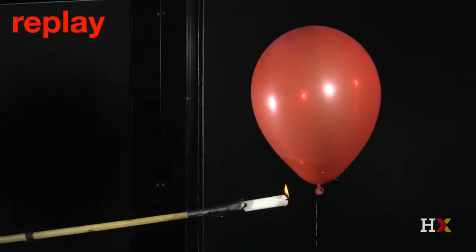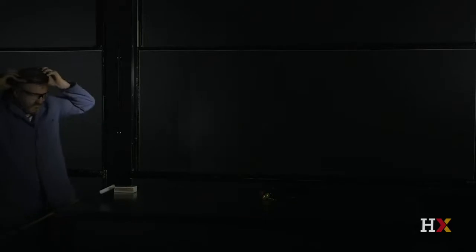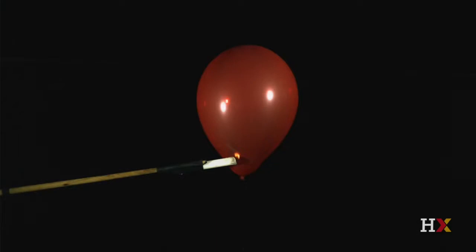This time, when the flame touches the balloon, it pops open with a very loud and explosive sound, and an intense fireball forms immediately. But in this one, the candle is still lit. Let's look at this one in even slower motion.